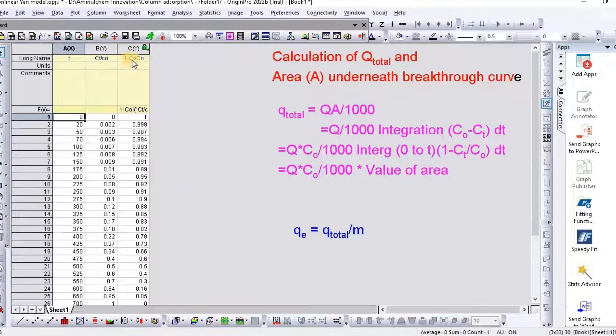So that 1 minus Ct by C0 equal to 1. Then go to curve.